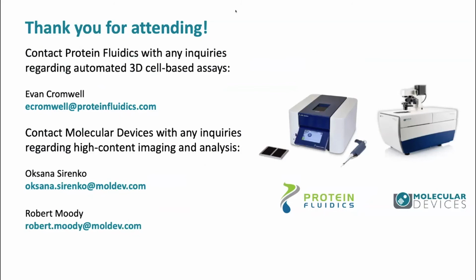Great. We've talked a lot about imaging here, so another question: since you've got fluidics and a COC structure that holds the organoid in place at the bottom of the well, are these designed for imaging, or are they suitable for standard plate readers as well? They can be used on pretty much any downstream analysis system. So yes, plate readers, if you want to do fluorescence; we've done luminescence reads using the CellTiter-Glo assay kit.